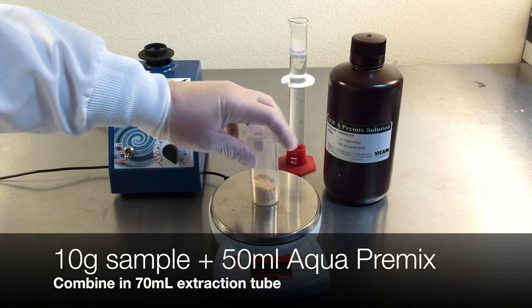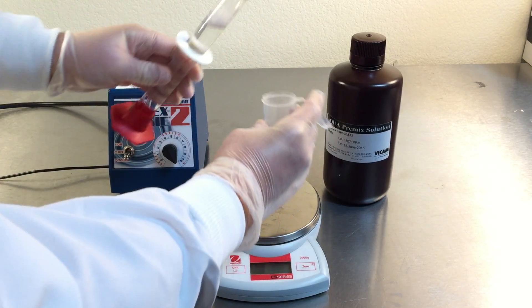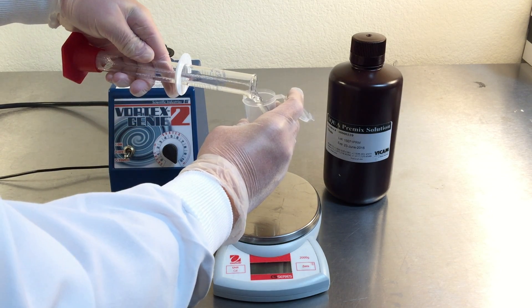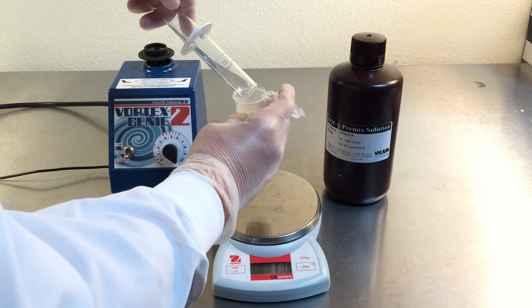Measure 10 grams of ground peanuts or peanut paste sample. Combine with 50 milliliters of Aqua pre-mix extraction solution in a new 70 milliliter extraction tube.